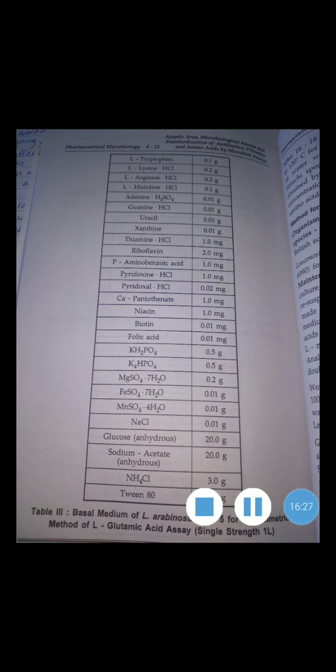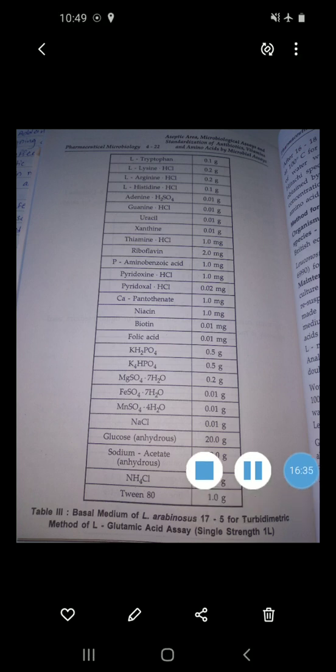This gives a final concentration of 10 microgram per ml valine and leucine, and 2.5 microgram per ml methionine. Then the glassware used is Pyrex test tubes measuring 115 by 16 mm fitted with aluminum caps. Chemically cleaned and sterile glassware is used. Then sera were obtained from healthy volunteers, or otherwise healthy patients undergoing minor surgery.